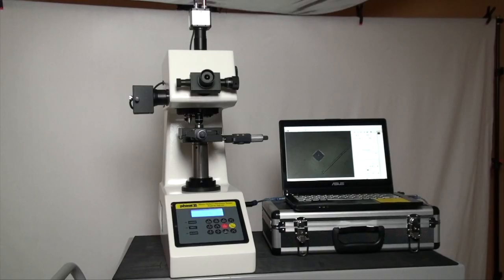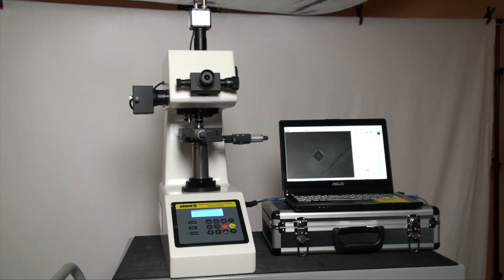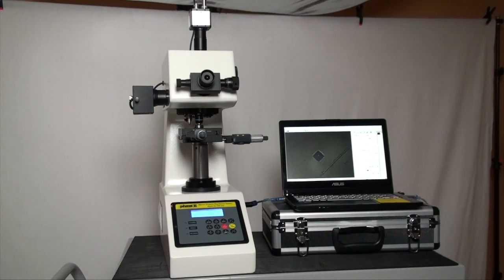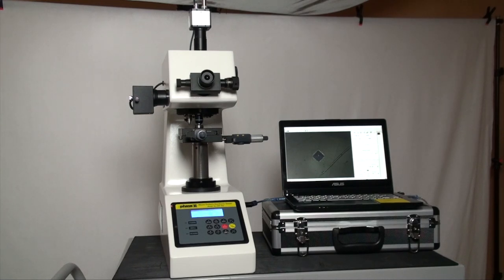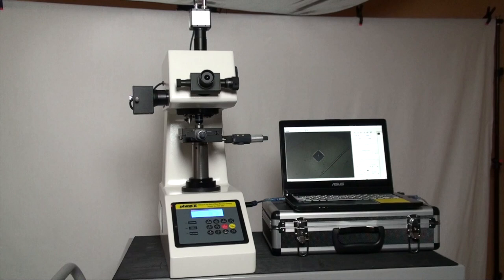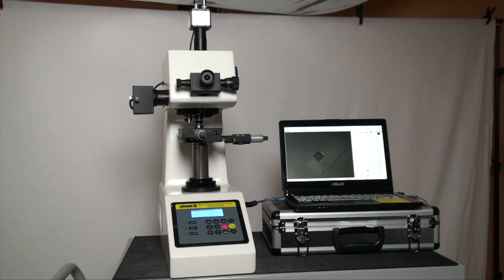This is an instructional video detailing the applications and functions of the Phase II Digital Micro Vickers Hardness Tester with AutoTurret. These hardness testers are designed to test primarily metals using the Vickers hardness method. They are state-of-the-art precise testing systems suitable for hardness analysis of metallic specimens in metallography laboratories or production environments.